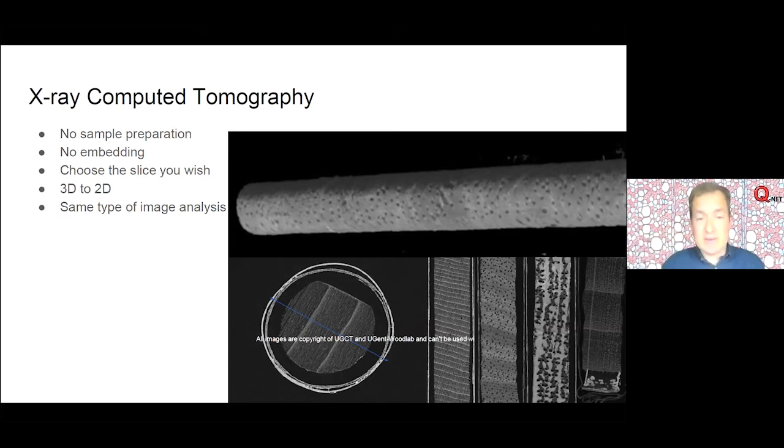So this is a bristlecone core. On the left, you see that it's in a paper straw. I cheated, they had already been sanded, but I scanned them anyhow. And the main advantage of CT is that you can pick your own slice, free from defects, free from surface preparation, or ruptured cell walls. And that is for me the main advantage of a CT.